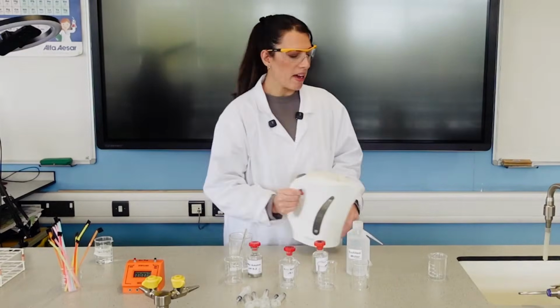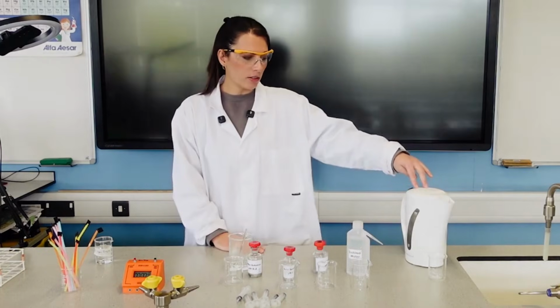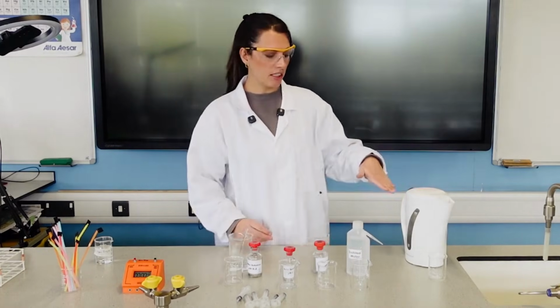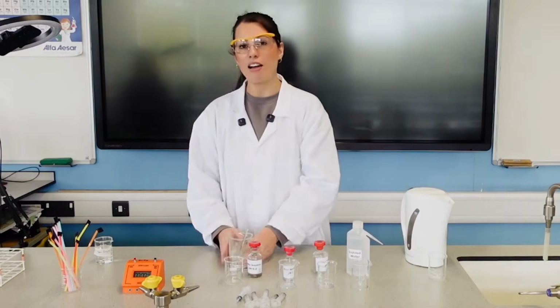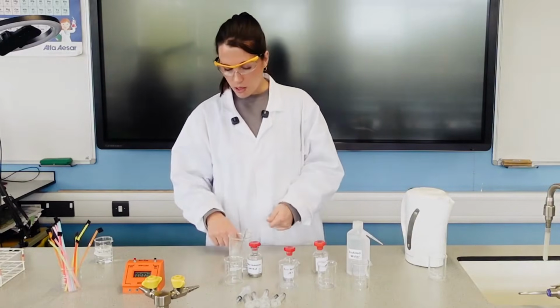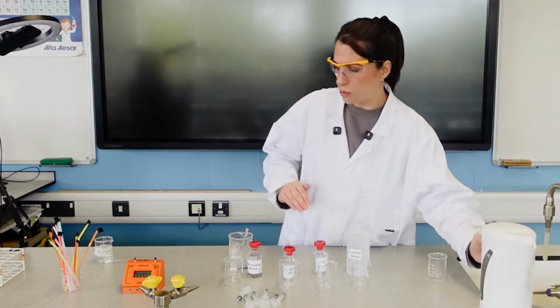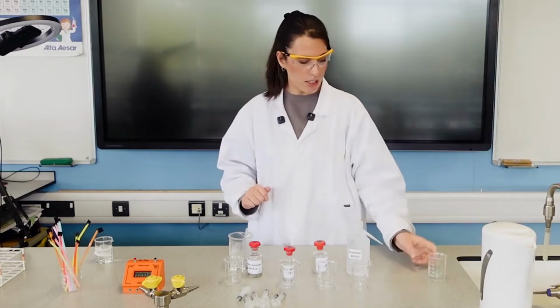Now, if we want it to be about 37, I actually boiled that kettle a while ago. The temperature of the water from the kettle does drop quite quickly from 100 to 90, but still, we want this at around 37 or 40. You decide. I'm going to go for 40 degrees C. So I've deliberately not half filled it because I know that I'm going to have to add some cold water to bring the temperature down a bit.